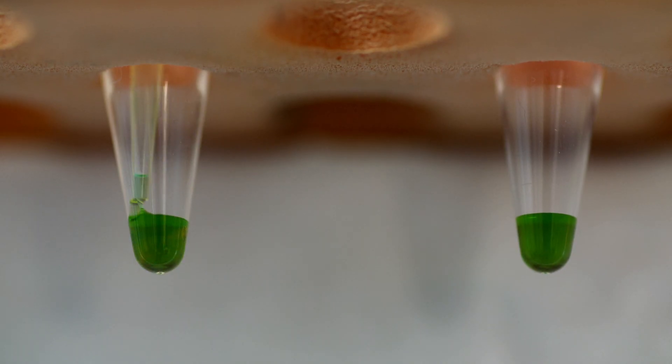The color pipetting helps when you're working in a large team so people can take over tasks and if you get interrupted then you can just carry on from where you were before.